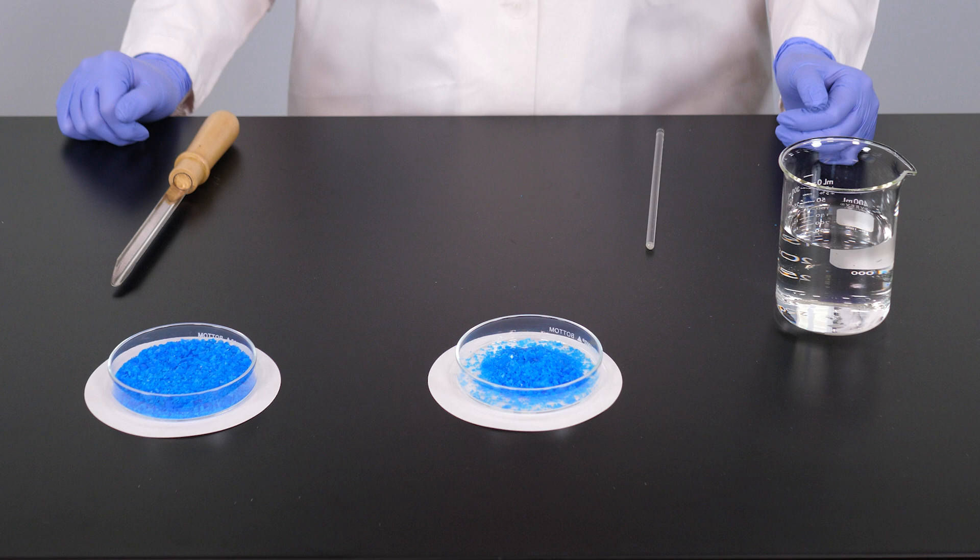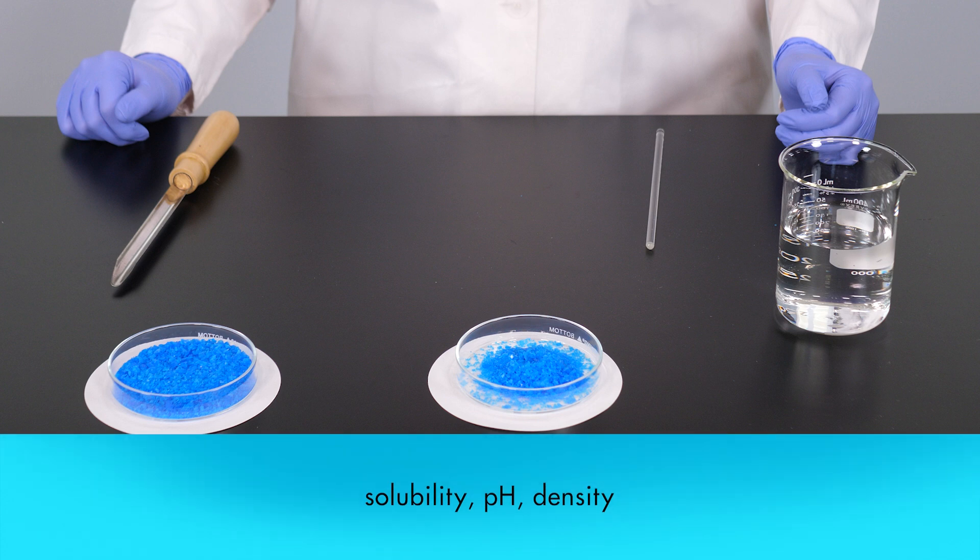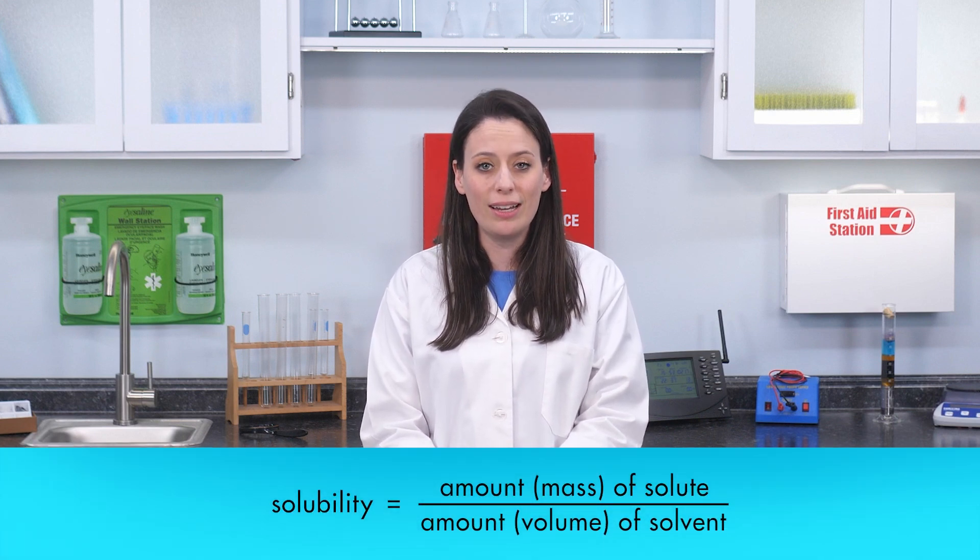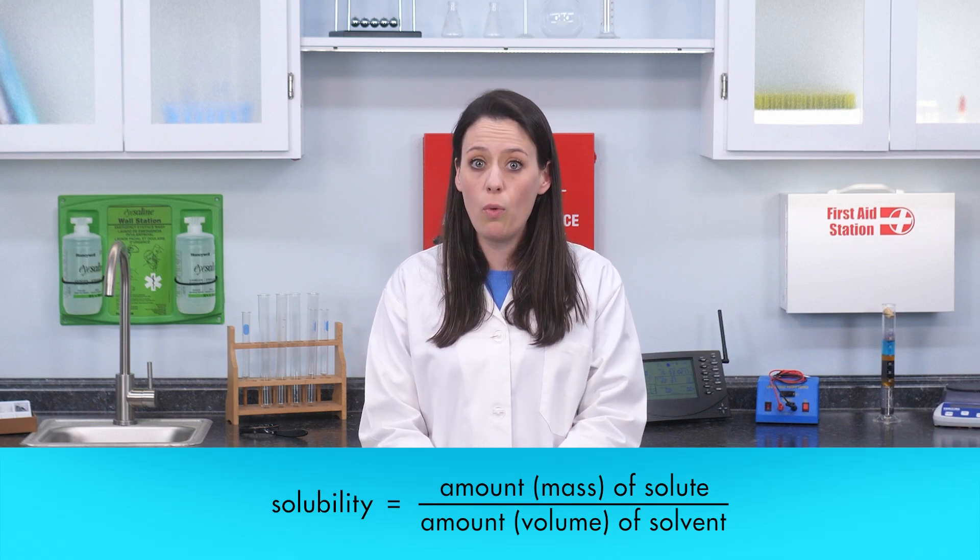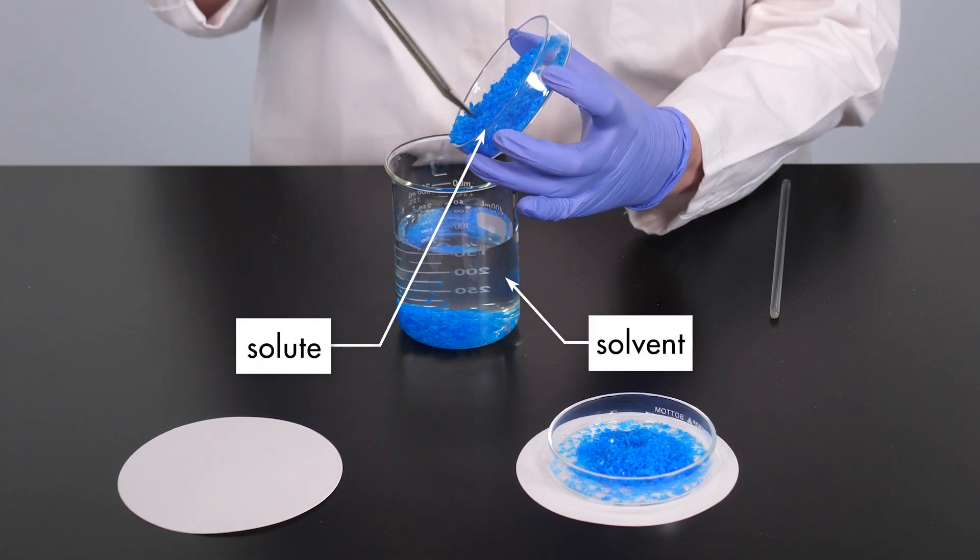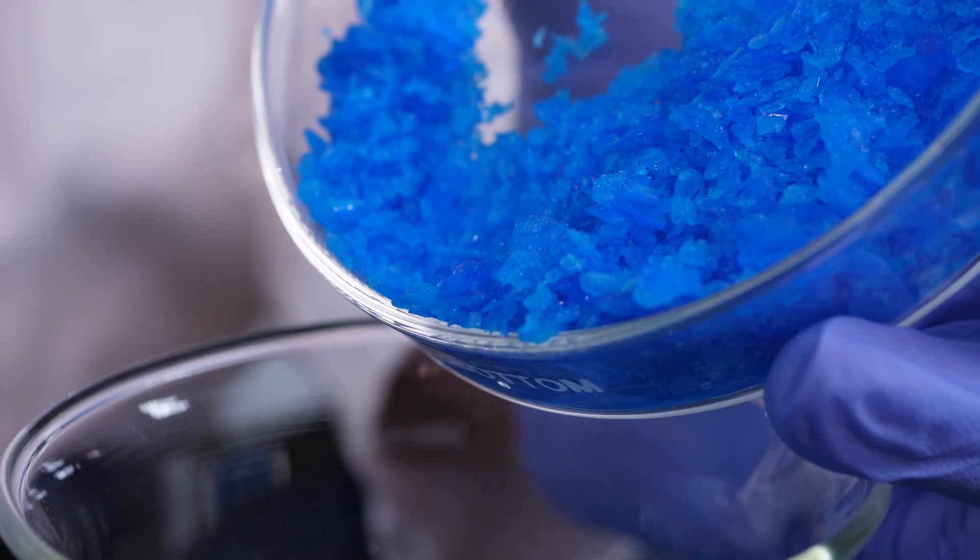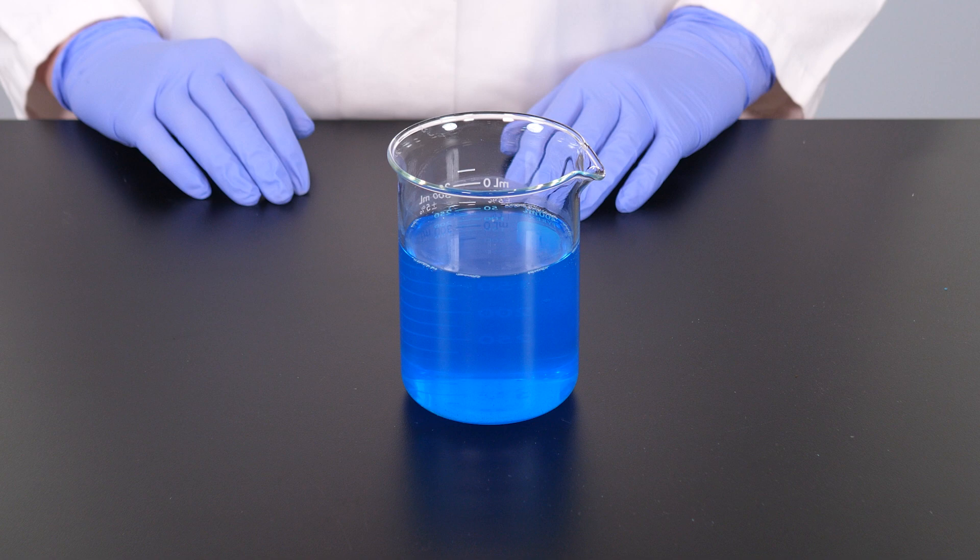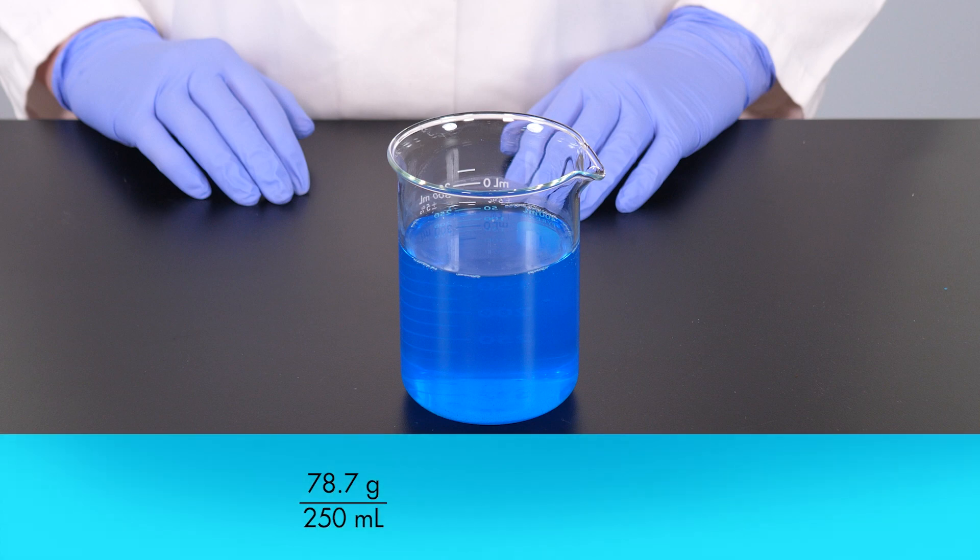Now we move on to experimentation, which involves a set of tests to help us arrive at a conclusion. During our experimentation, we test the substance for solubility, pH, and density. To determine the solubility of the substance, we find the maximum amount of the substance, the solute, that will dissolve in an amount of water, the solvent. Measured amounts of the solute are added to the solvent, and the mixture is stirred. We keep adding solute and stirring until no more solute will dissolve.